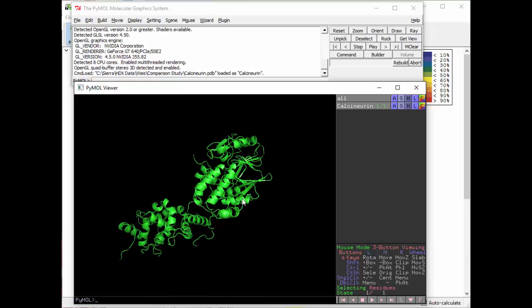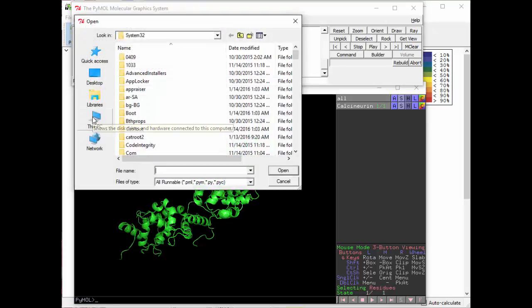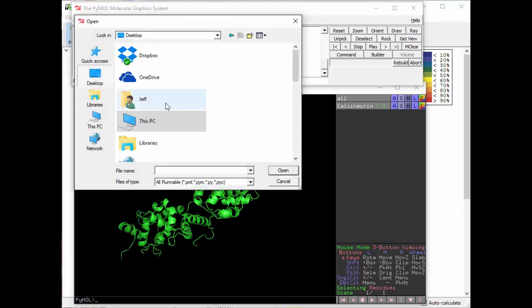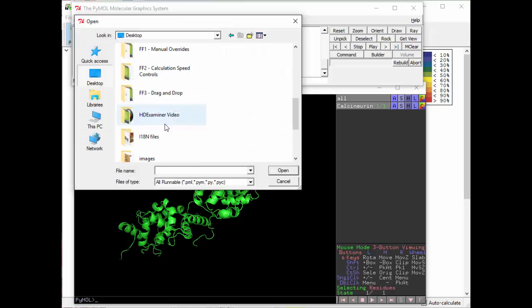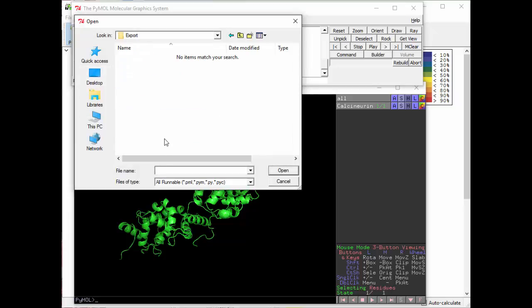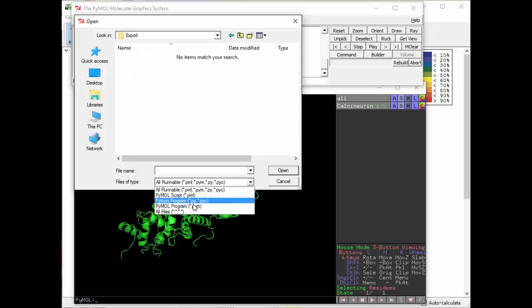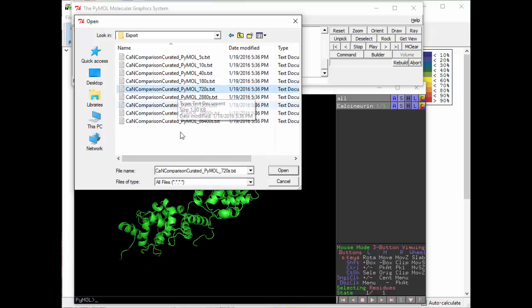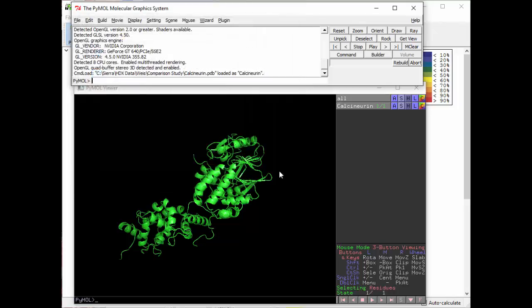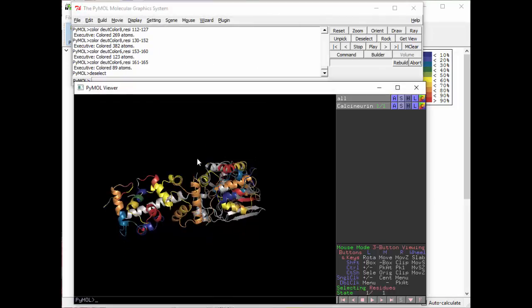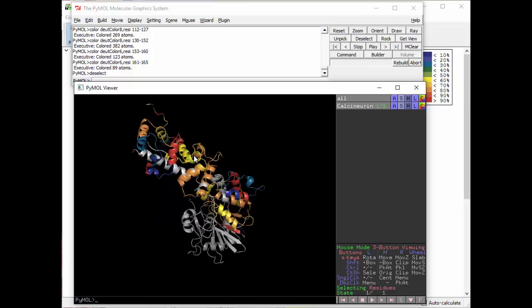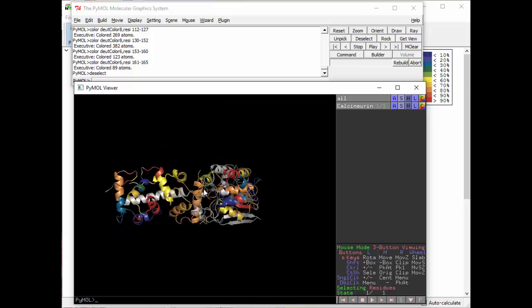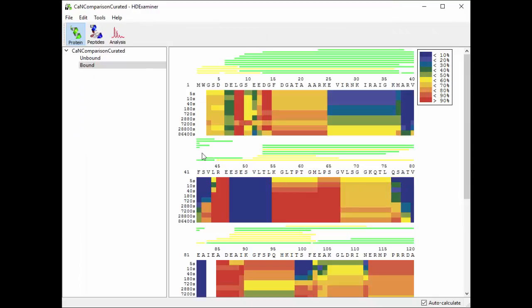And now all I have to do is run under File, Run, and run one of those scripts that I just created with HD Examiner. I'm going to show all files because they're actually text files. I'm going to pick the 720 second one. And it runs that script and colors the protein based on the 720 row here.